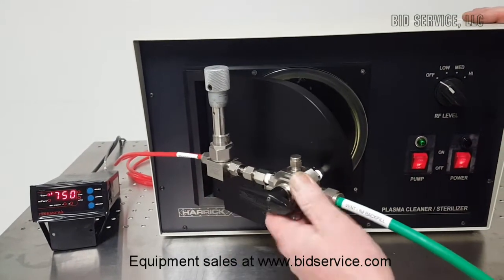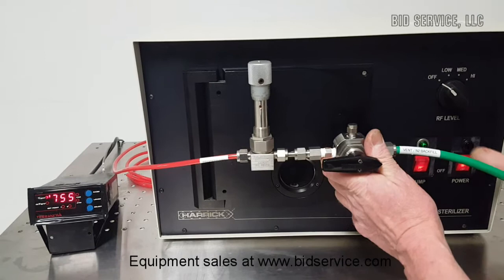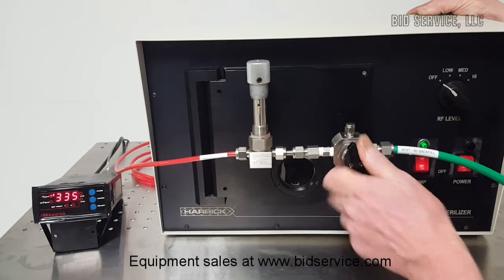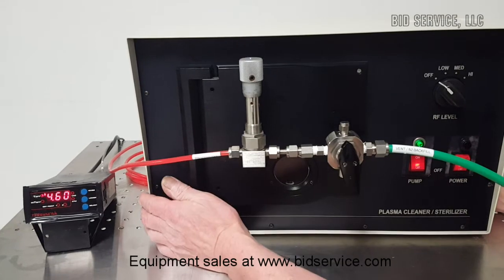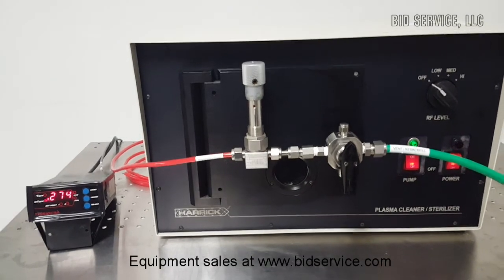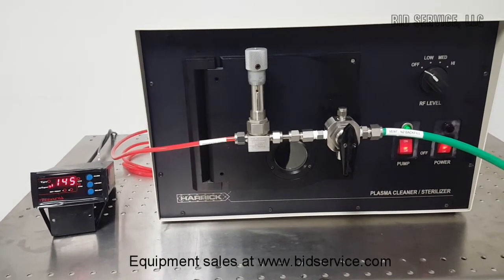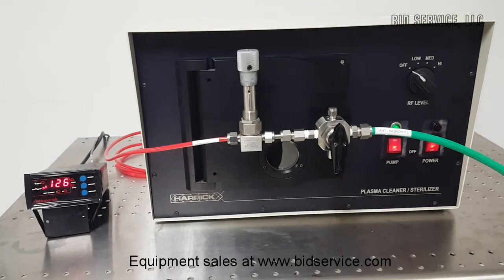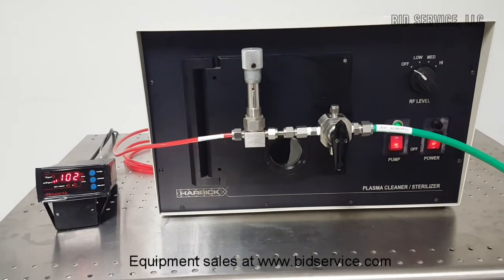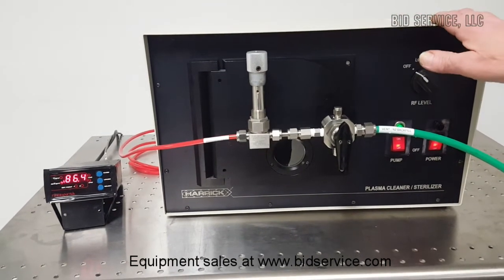The chamber will seal itself. It aligns perfectly with these pins here. Once you start, make sure your vent valve is off and your valve is in the vertical position. The chamber will begin to pump down. We have a really strong pump on here — we are already down to 86 millitorr.